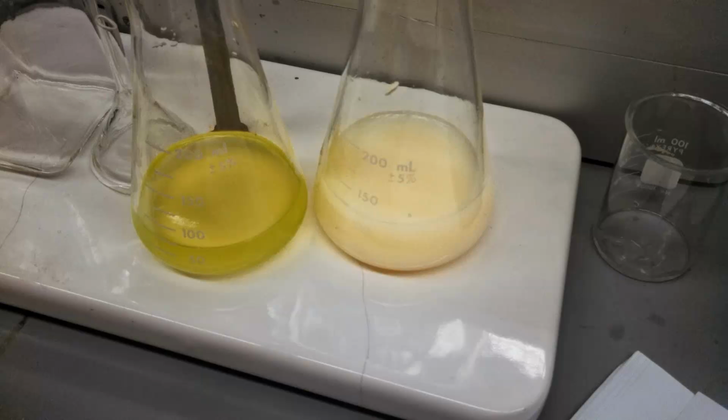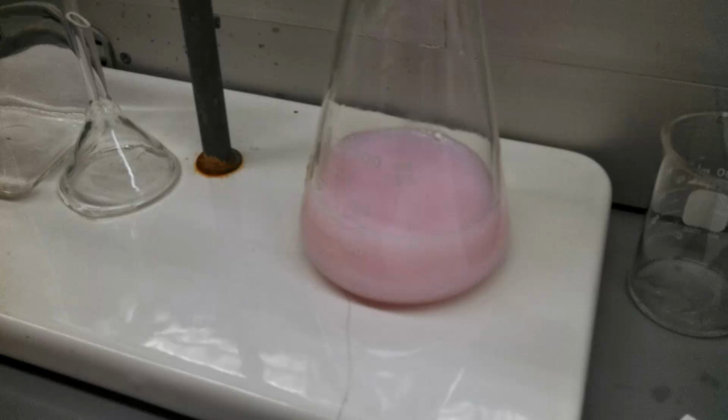It's difficult to see in a picture, but the point at which this pink is faint and persistent throughout the entire flask is your endpoint. Looking at it in this picture, it seems milky white, and it is, but there is a pink hue to it. That's what you're looking for. If you go too far, it'll turn into sort of a Pepto-Bismol color, and this is what you don't want. This is far too much pink.